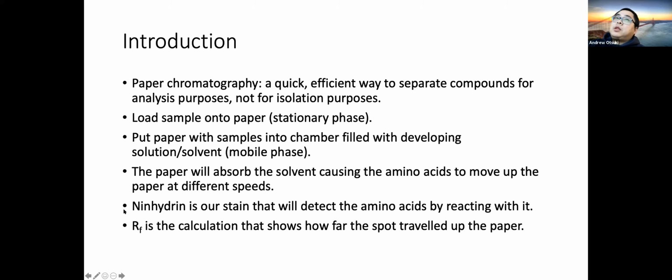Ninhydrin is used to stain amino acids, so it reacts with amino acids. We'll go over that later. But the RF right here is the calculation that shows how far the spot traveled up the paper.